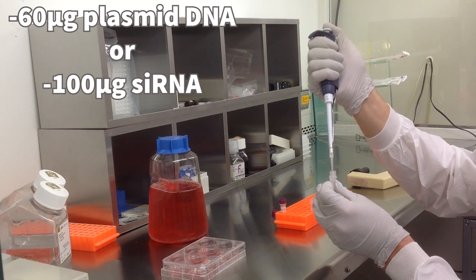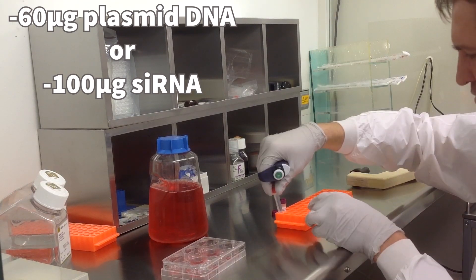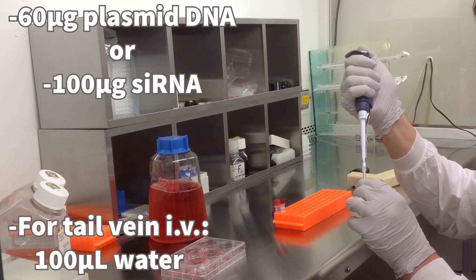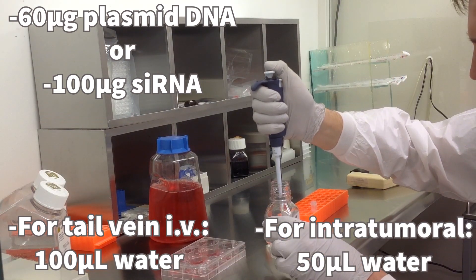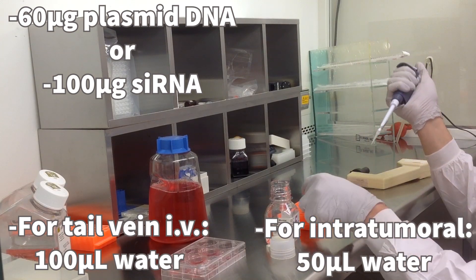Start by diluting 60 micrograms of plasmid DNA or 100 micrograms of siRNA into either 100 microliters of water for tail vein IV, or 50 microliters of water for intratumoral IT administration. All water used is DNA- and RNA-free, molecular biology grade water.